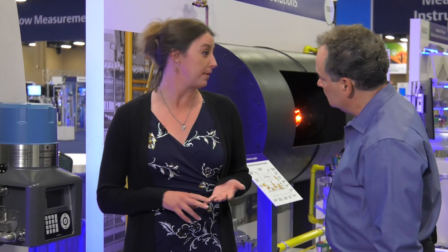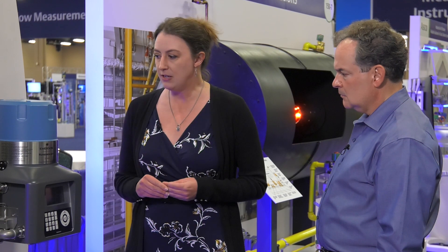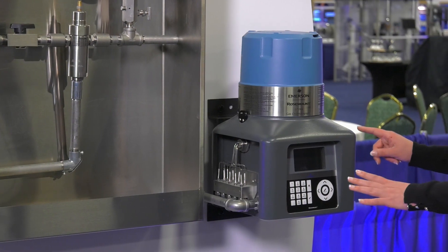Our customers at refineries and petrochemical plants often use sampling and conditioning cabinets like this one to prepare samples for analysis by online gas chromatography. And what we find talking with those customers is that oftentimes they're getting inaccurate results out of the gas chromatograph. Those inaccurate results can cause a significant amount of wasted time and money as they try to troubleshoot and figure out the source of that issue.